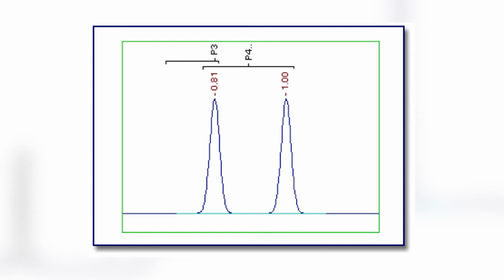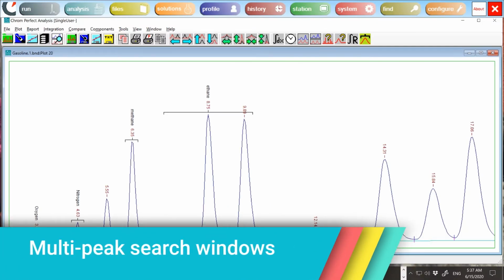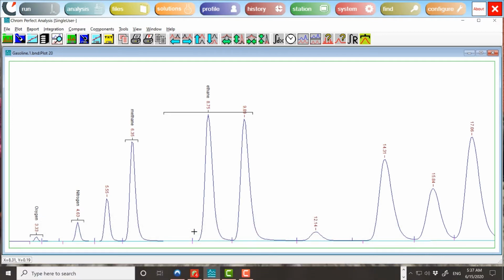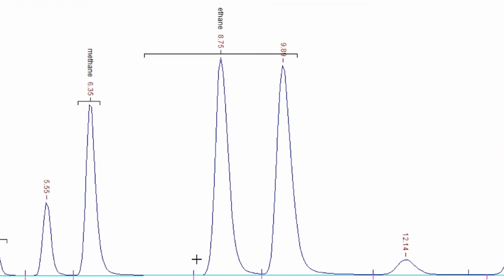The calibration editor does not warn about overlap, but a cursory check will reveal most problems. If retention time referencing is used, overlap may happen because of the adjustments. Multi-peak search windows. By definition, no component may be identified with more than one peak. However, it is frequently of interest to consider all the peaks under a search window, and not only the centermost of these, the identified peak.